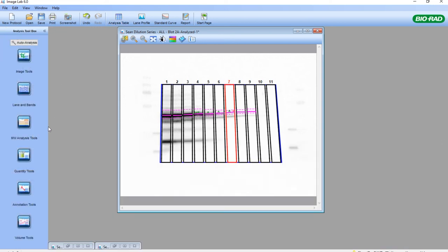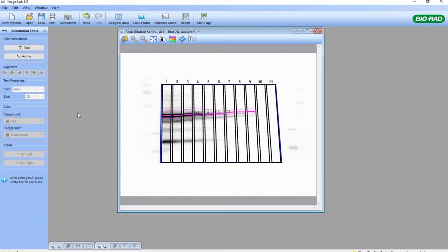Next are the annotation tools. Annotation is simply to write notations on the membrane. If we click on the annotation tool, we can add text — these are text boxes that we can click on and type information.